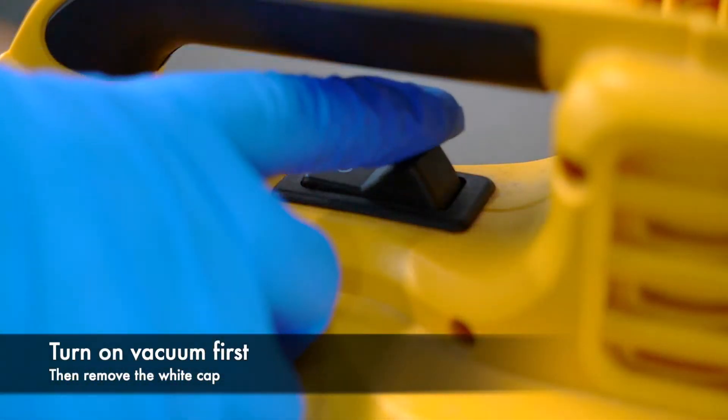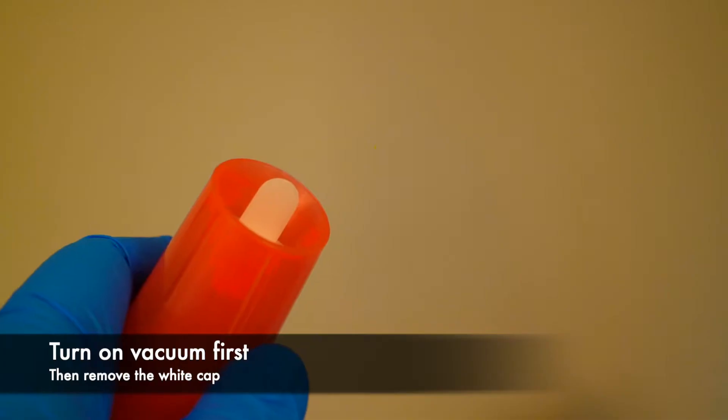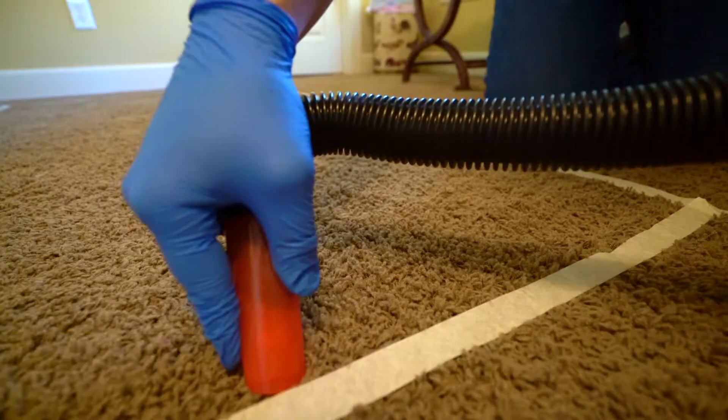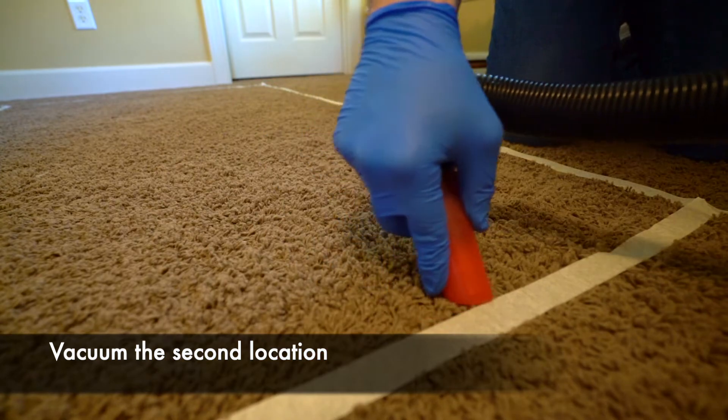Once you arrive at the second location, turn on your vacuum first, then remove your white cap. This will help prevent any dust from spilling out of the cassette. Now you can begin vacuuming the second location.